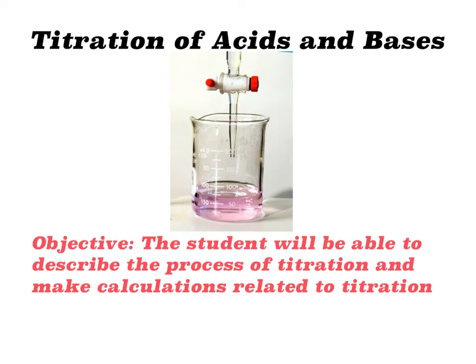Today we're going to be talking about titration of acids and bases. By the end of this, I'm hoping that you can describe the process of titration and make calculations related to titration.